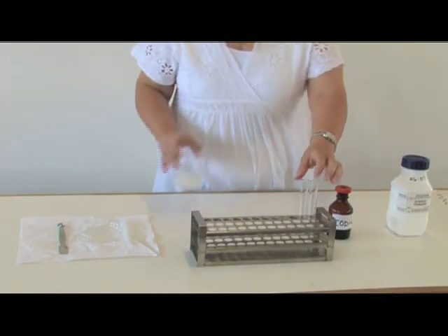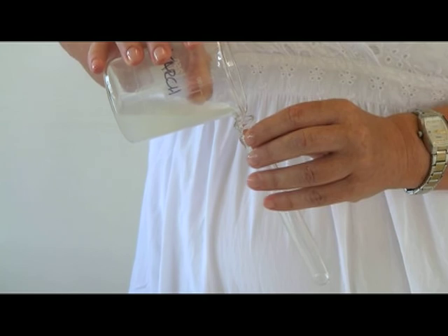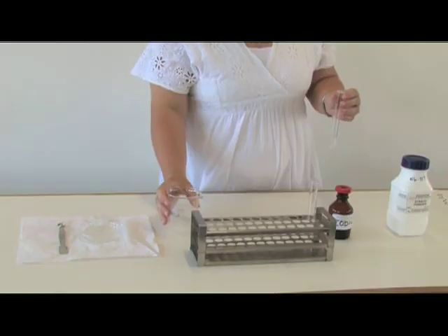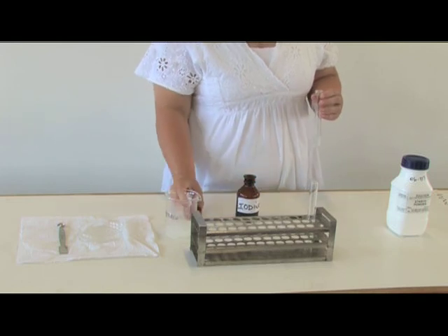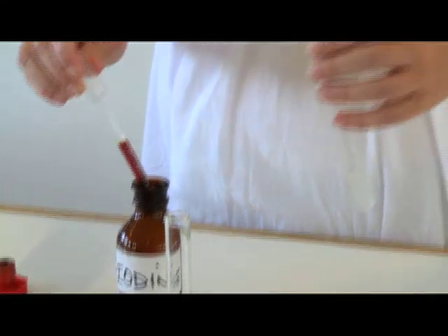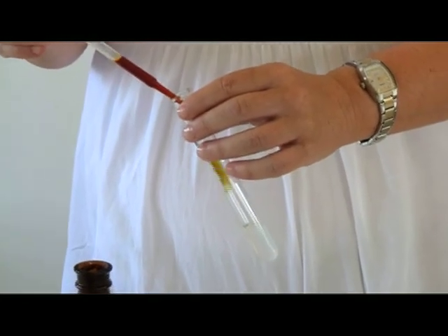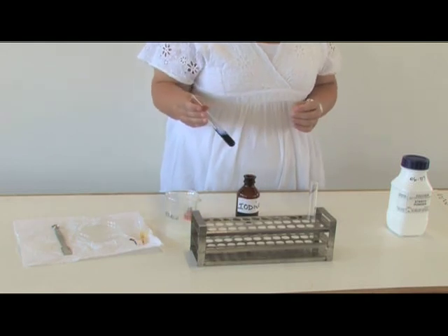You pour some of the starch solution into a test tube to the depth of two to three centimeters. You add approximately two to three drops of iodine solution to the starch solution and gently shake the test tube, and observe the change in color.